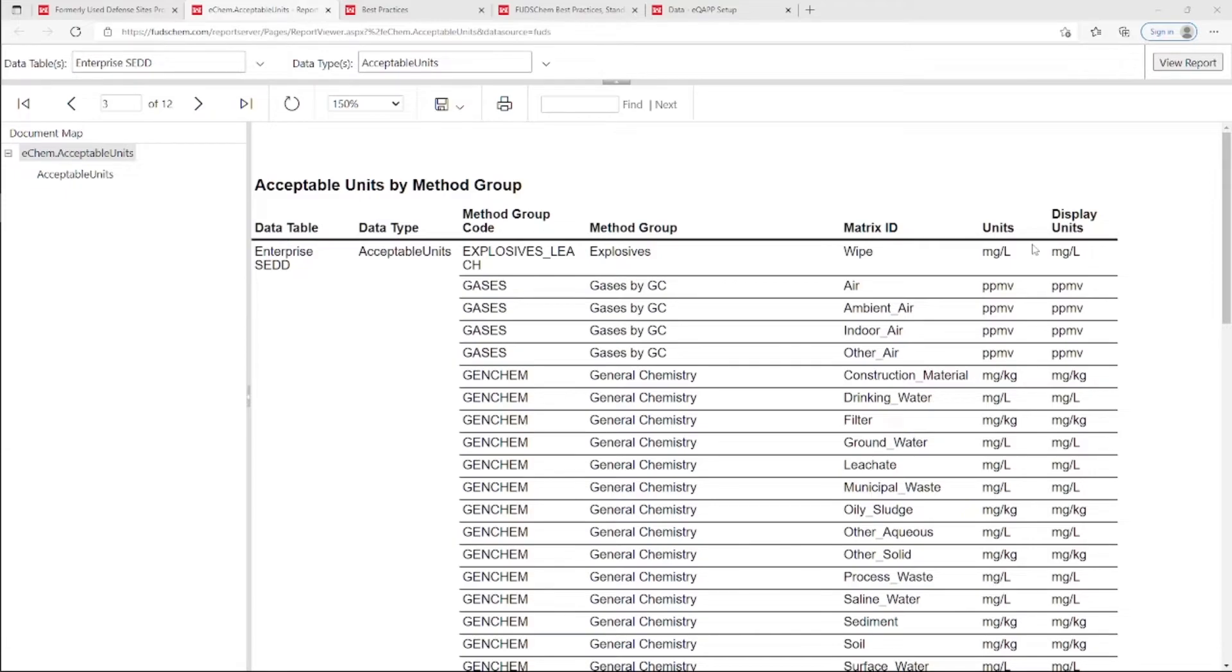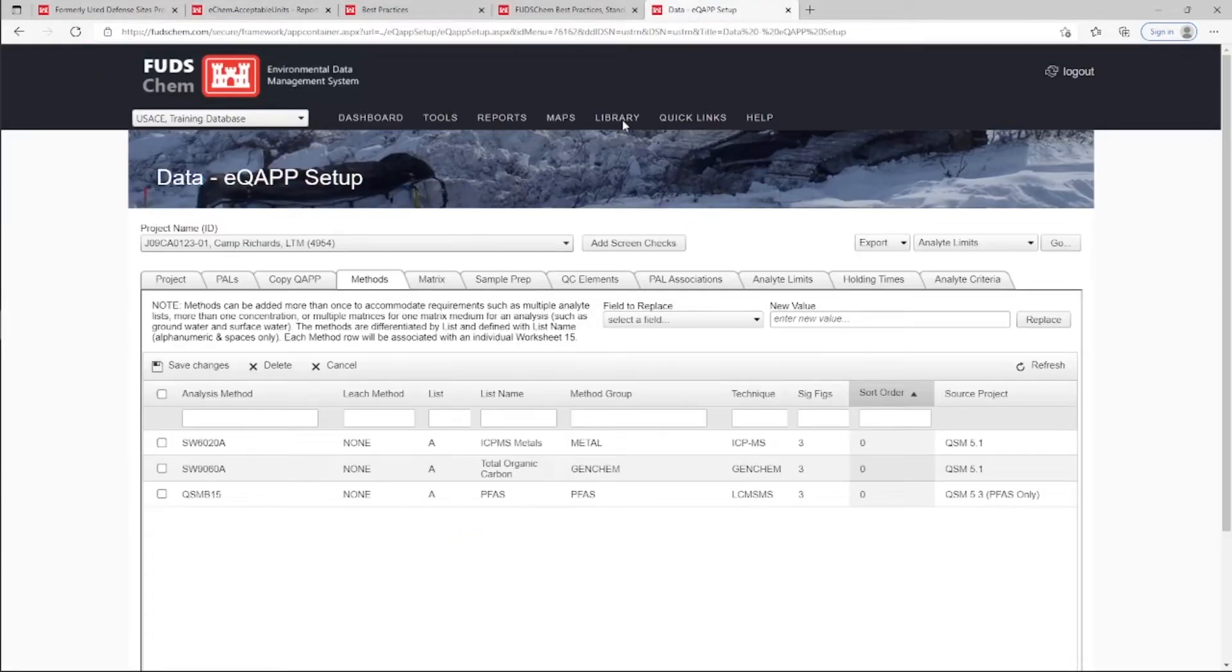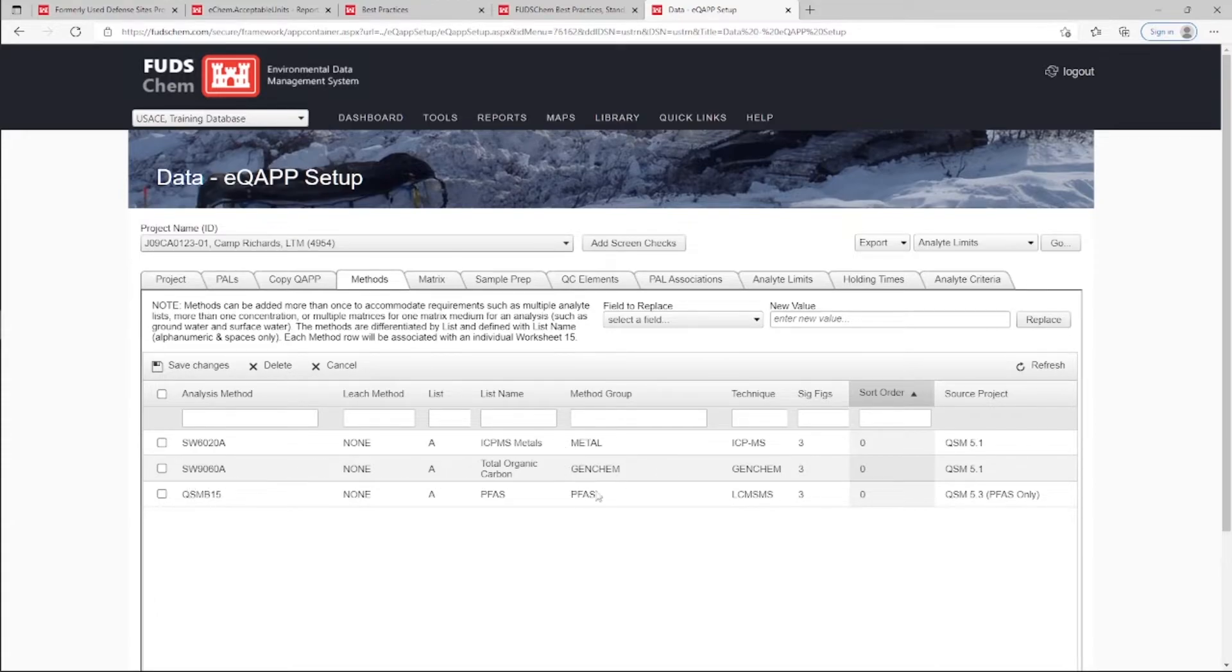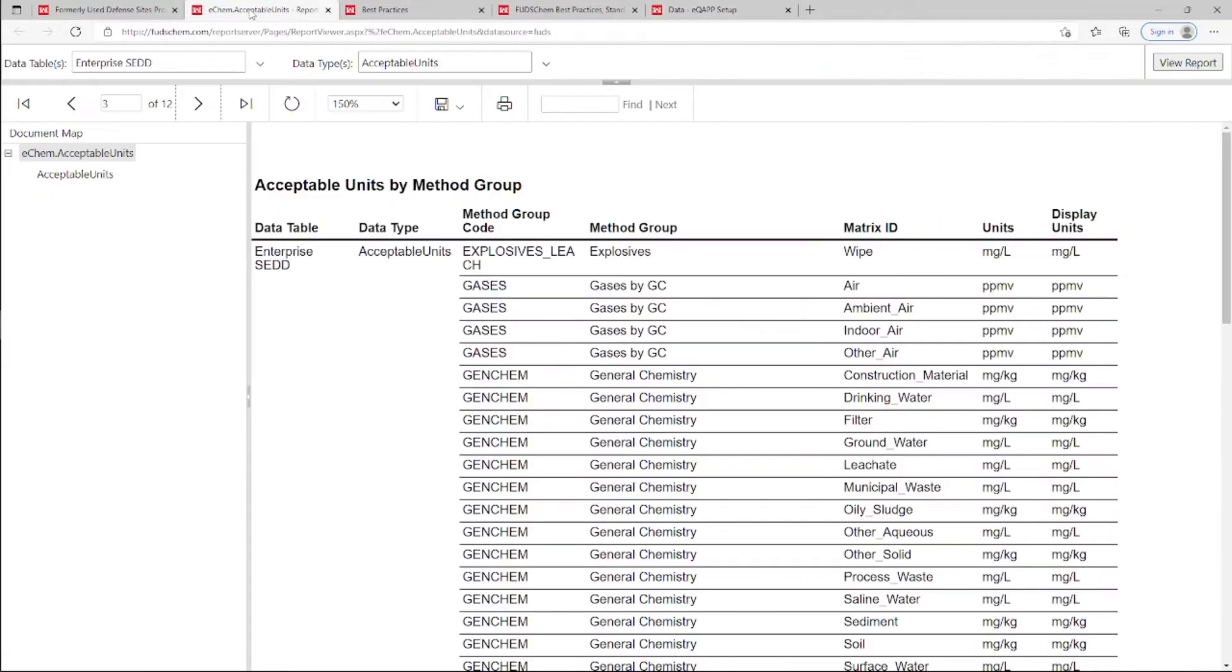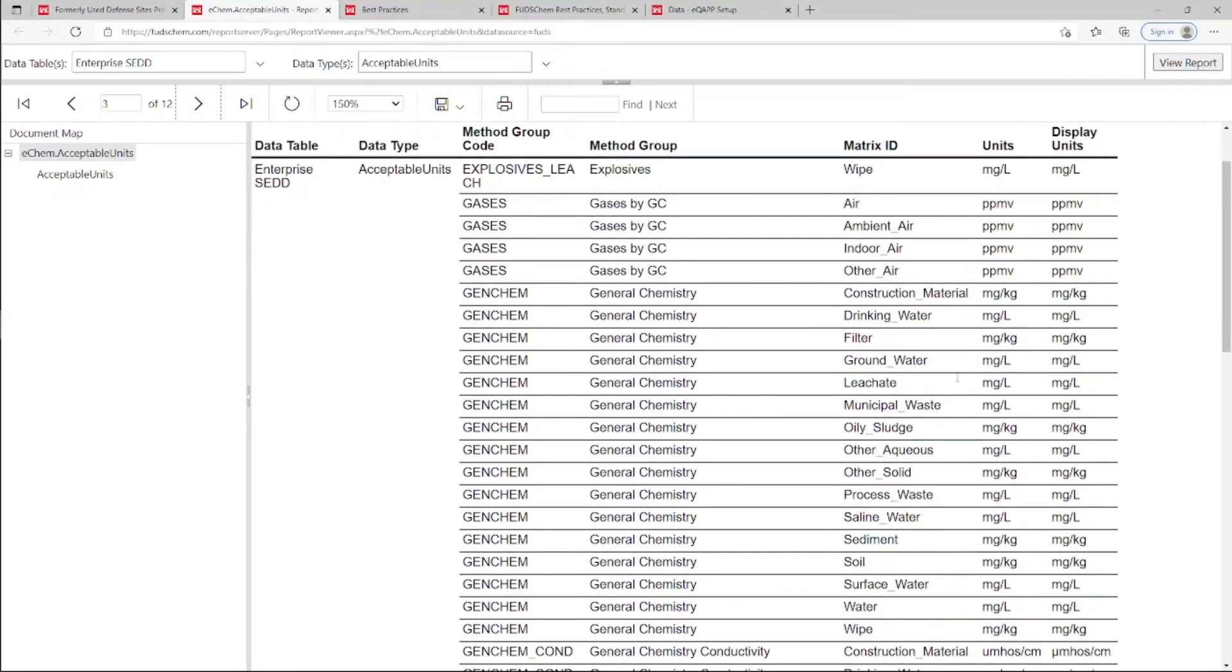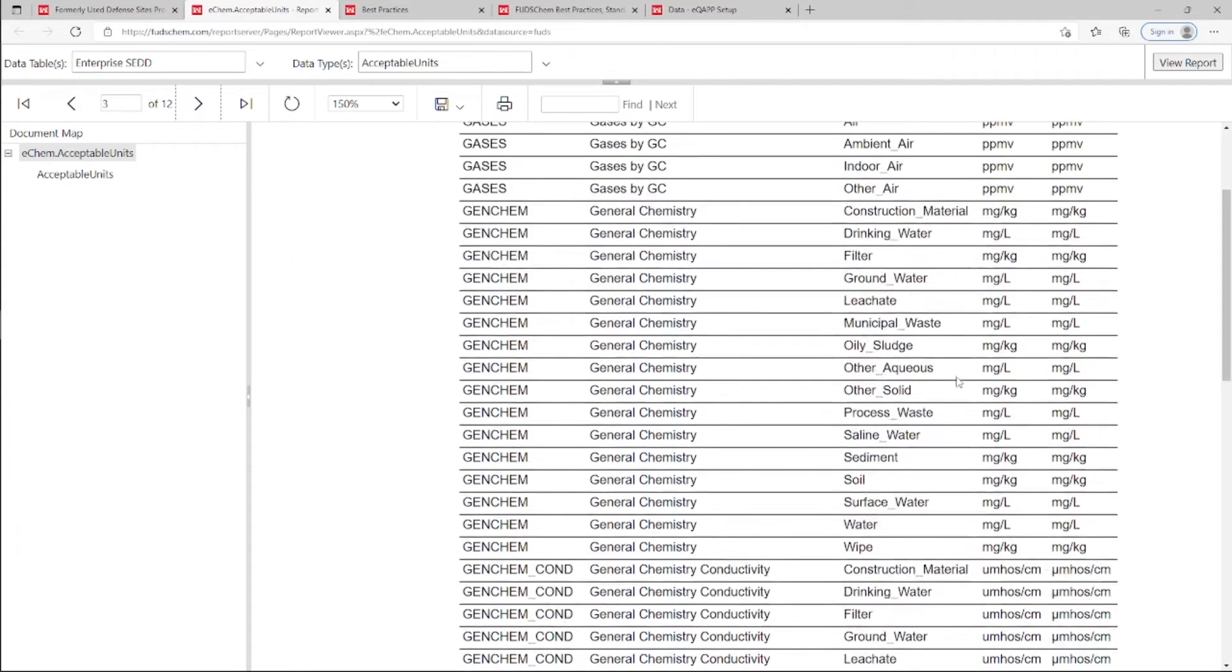For example, in the Methods tab, we can see that the Method Group for SW9060A is GenCAM. In the Acceptable Units report, we can see that there are 16 different options for matrices that can apply to that Method Group, and the matrix reported by the Lab would need to match one of them.